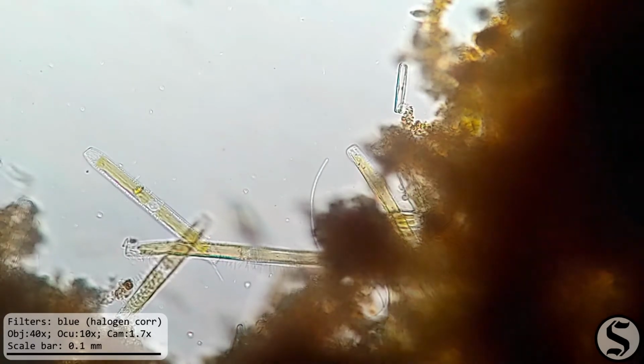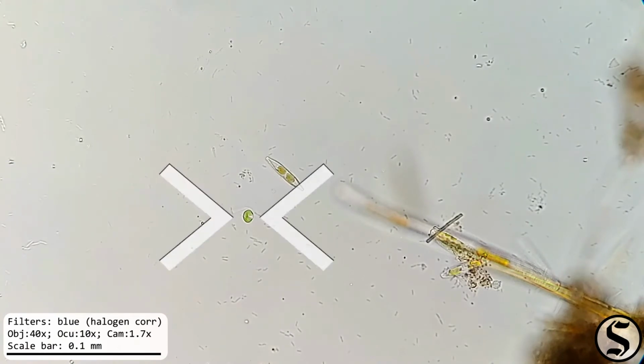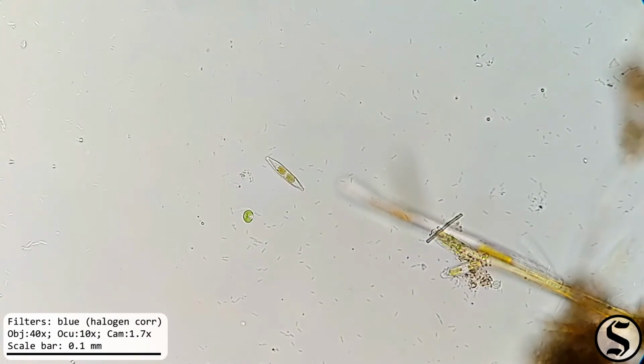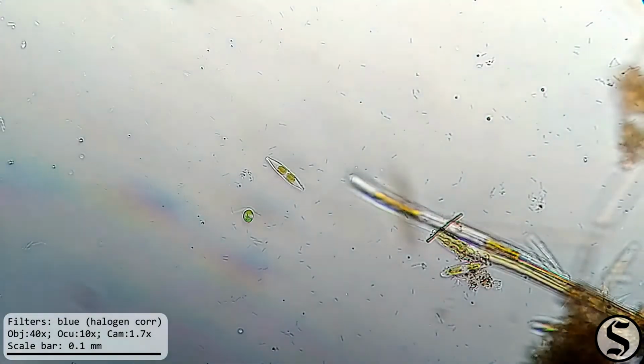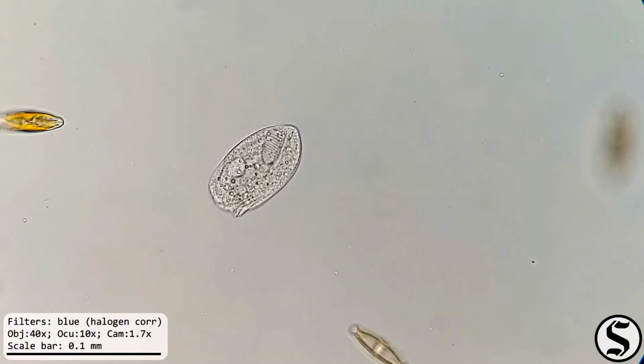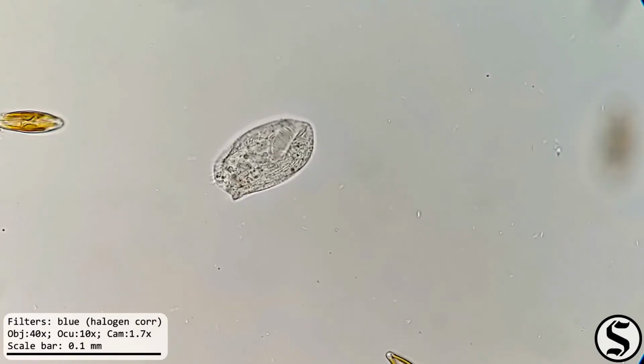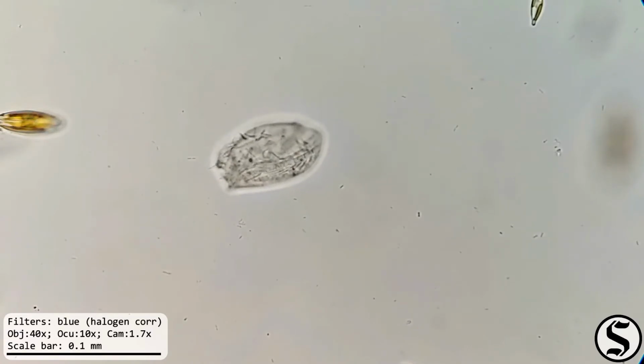I also saw this little flagellate. Flagella, recall, is Latin for whip. Doesn't seem to be really doing anything, but you can see the flagella. And here's a ciliate. Cilia is Latin for eyelash. And I don't know what type this is, but it's interesting to look at.